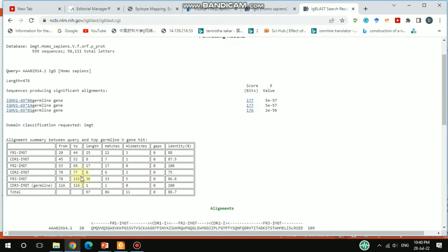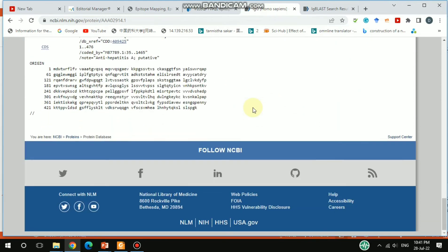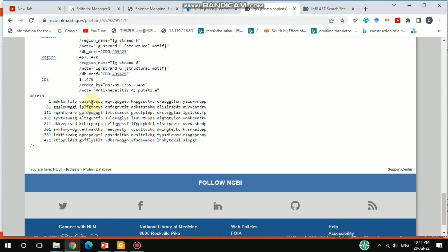In IgBLAST you get detailed information about CDR1, CDR2, and CDR3. The framework region 1 runs from position 20 to 44. CDR1 is at positions 45 to 52 — that is 8 amino acids long. Going through the sequence, position 45 corresponds to counting: 10, 20, 30, 40, and then 45, confirming this 8-amino-acid CDR1 region.